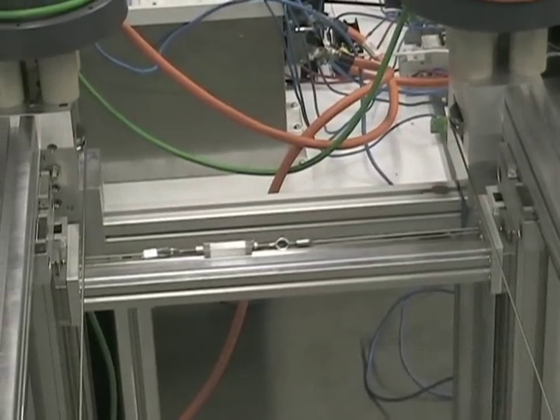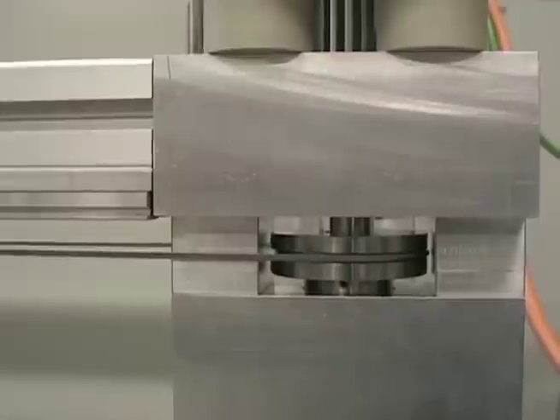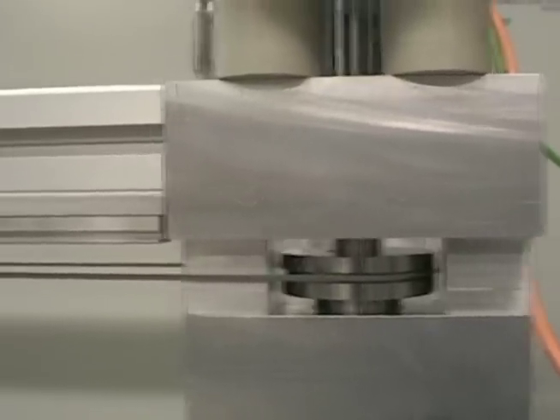This system will achieve high speeds of picking and placing, with an eventual goal of 600 tubes per hour.